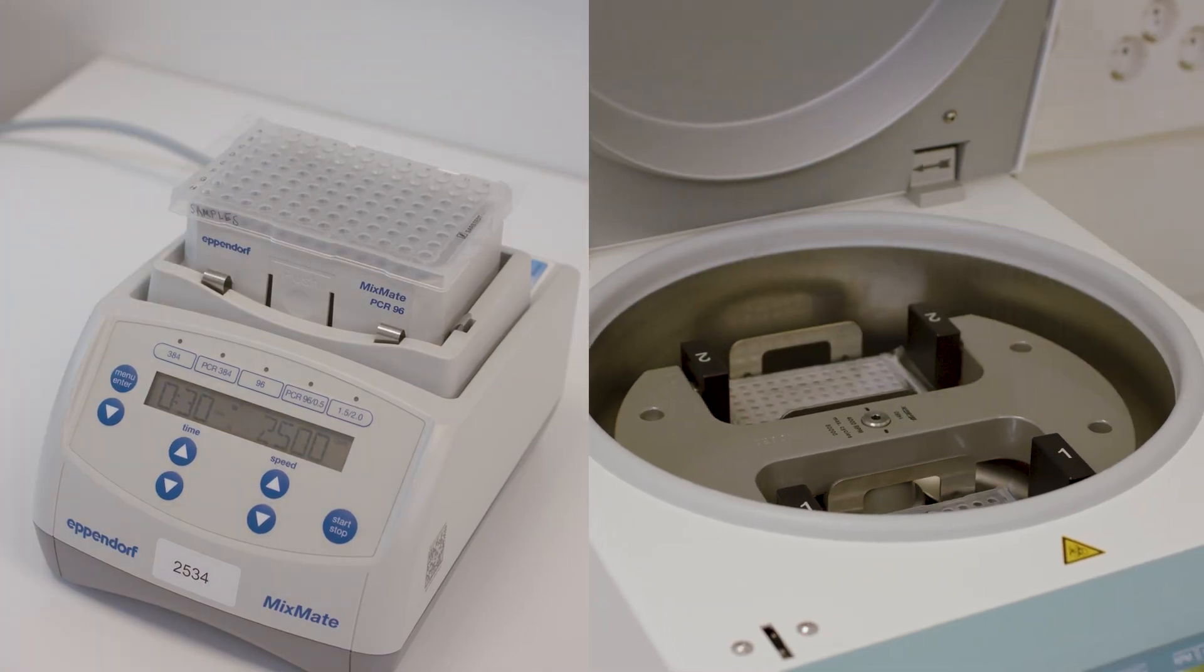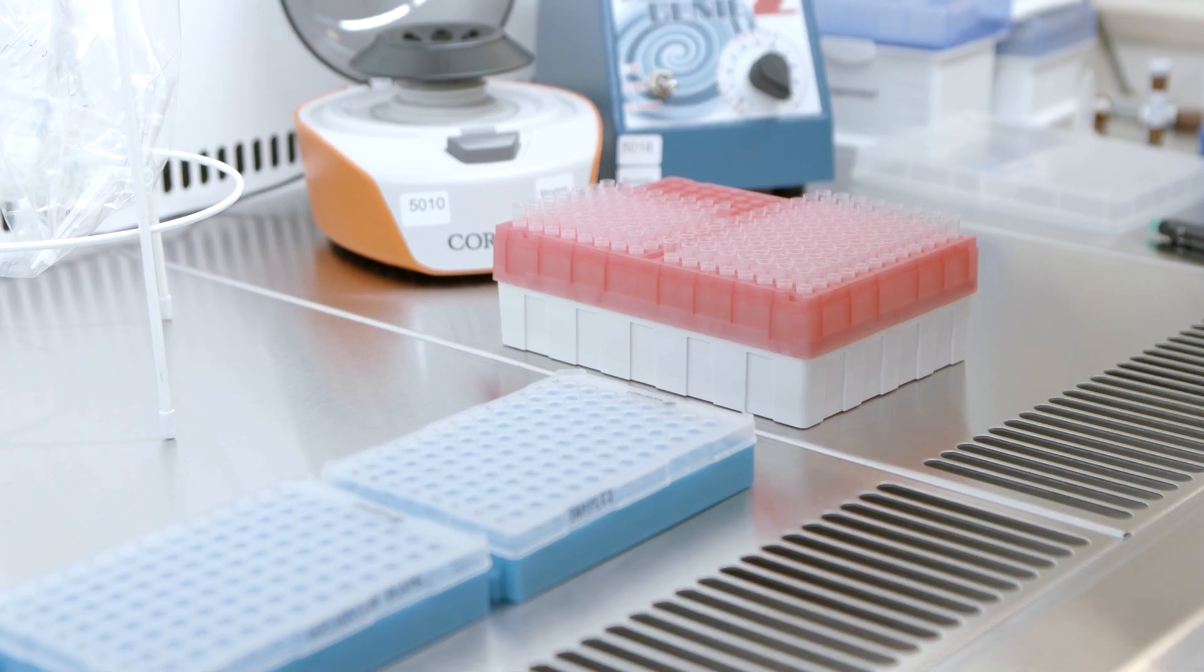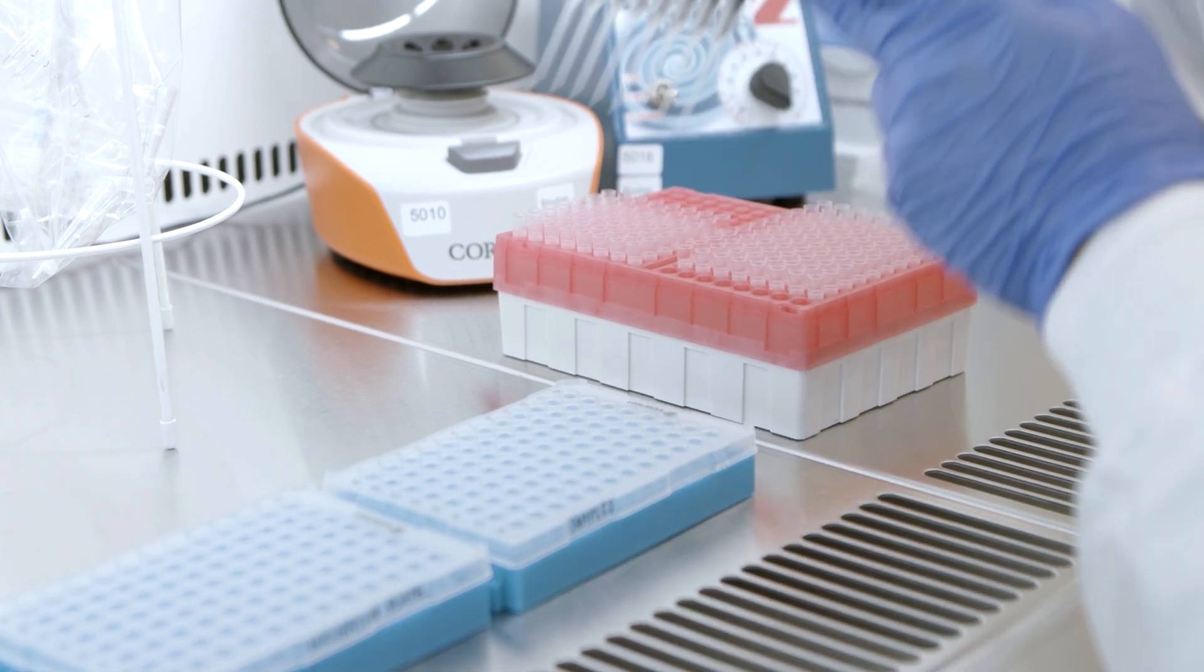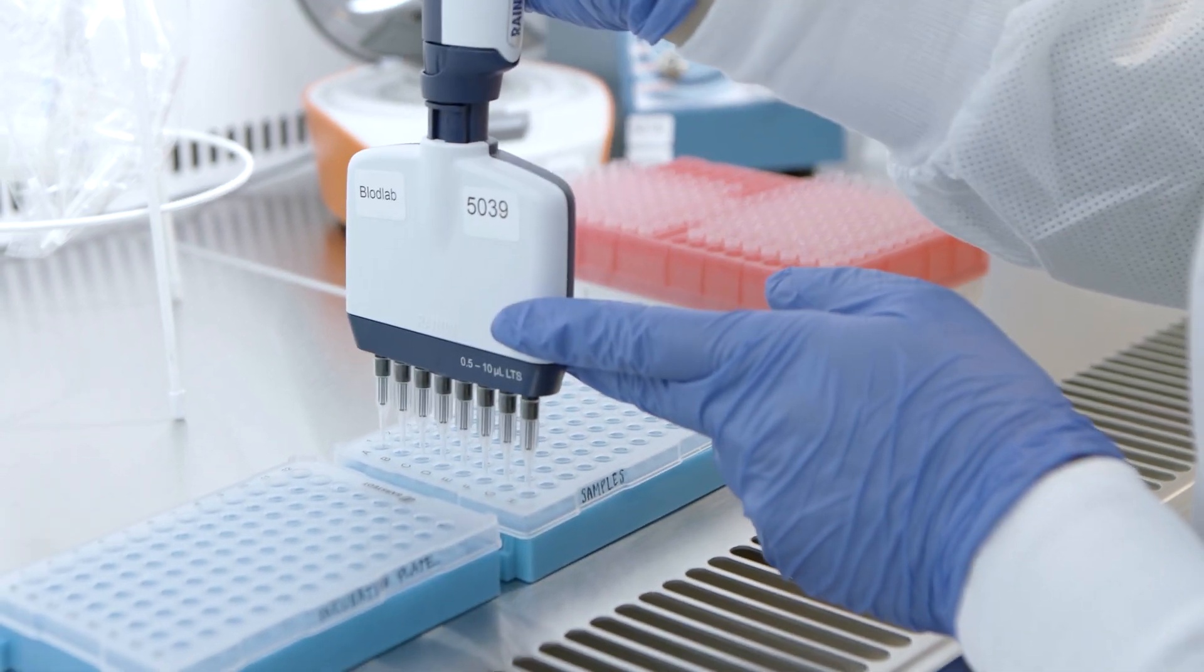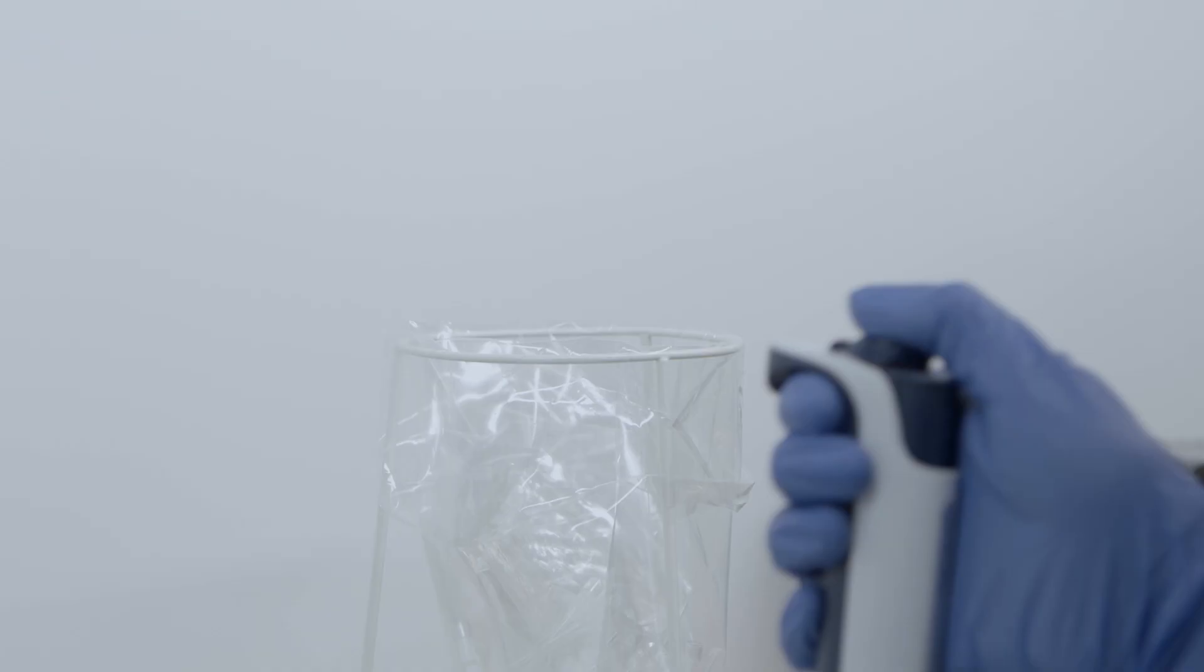Vortex the samples and spin them down. Transfer 1 microliter of each sample to the bottom of each well of the incubation plate, according to your sample plate layout, using a multichannel pipette and forward pipetting. Make sure to change tips between the columns.